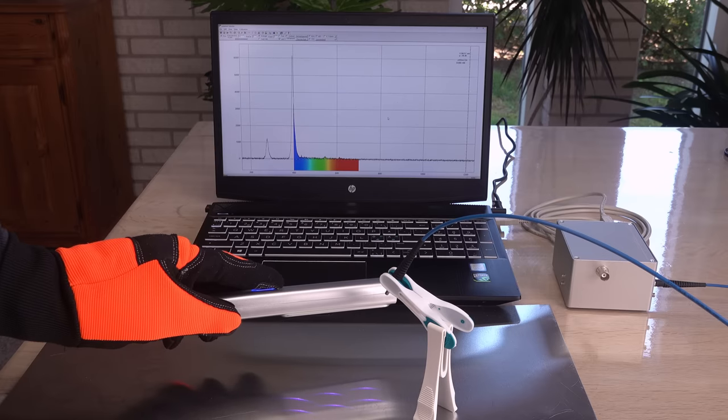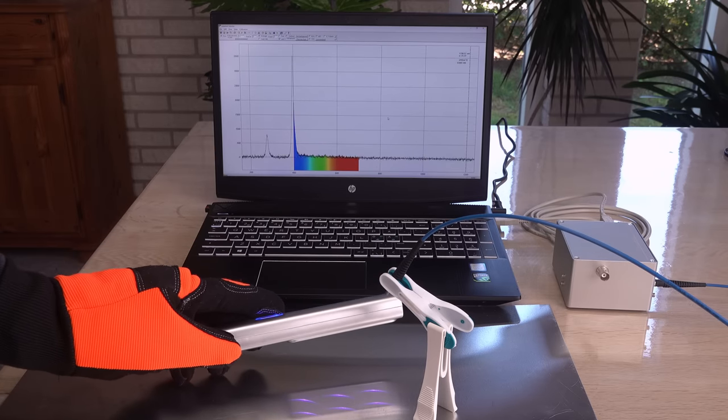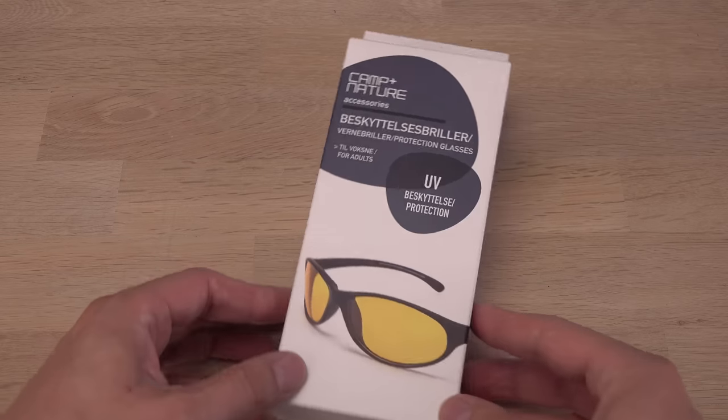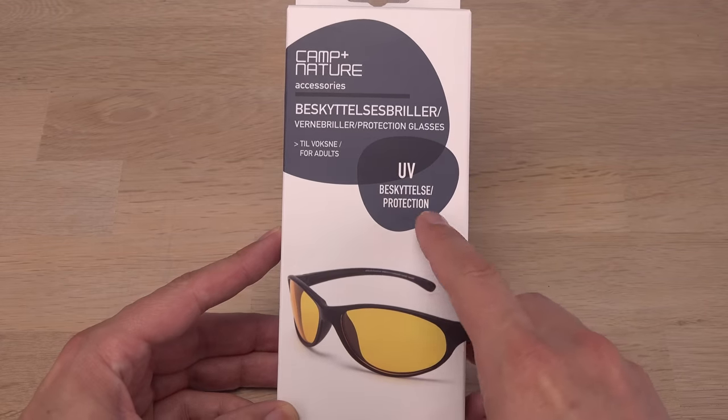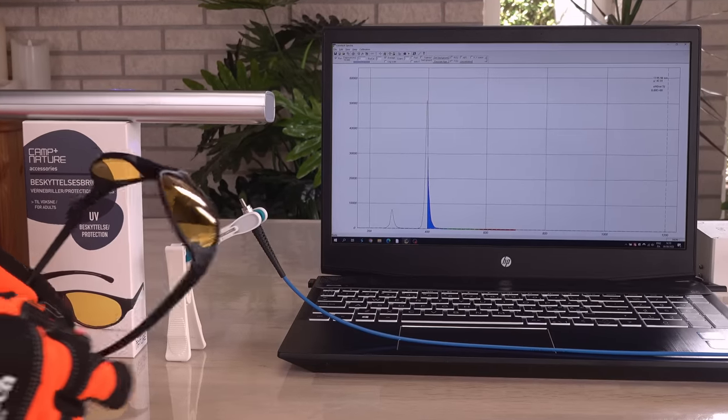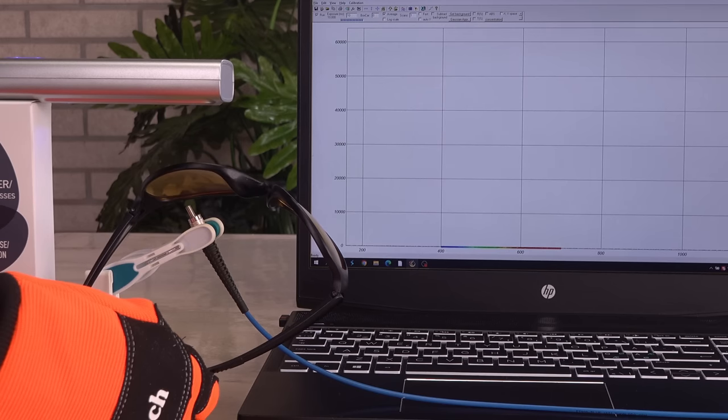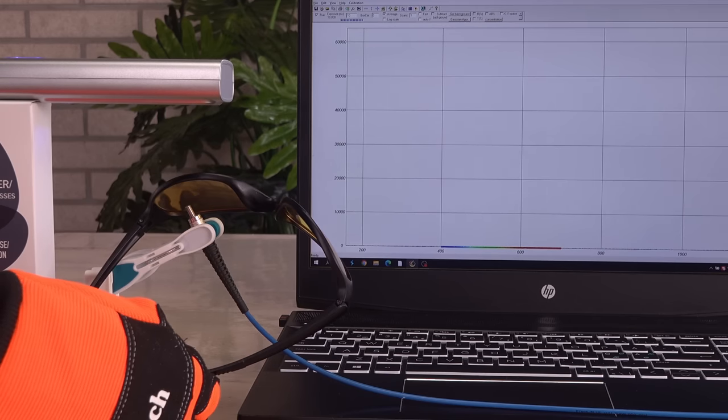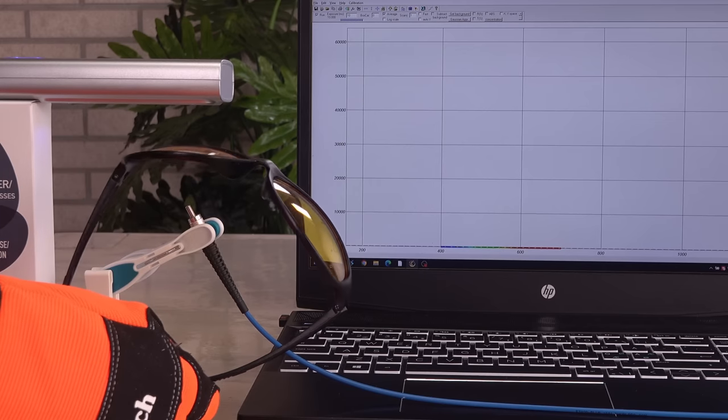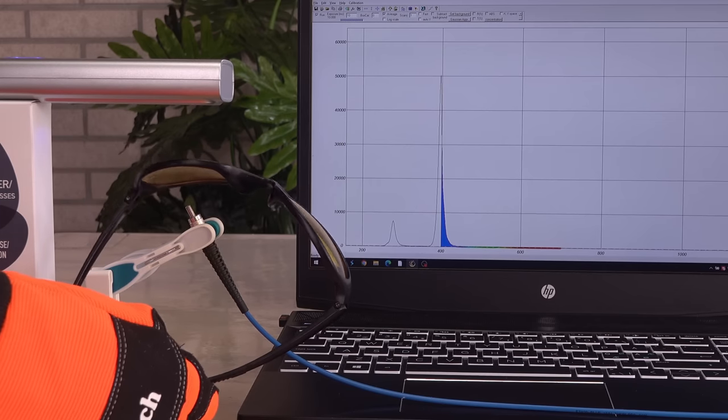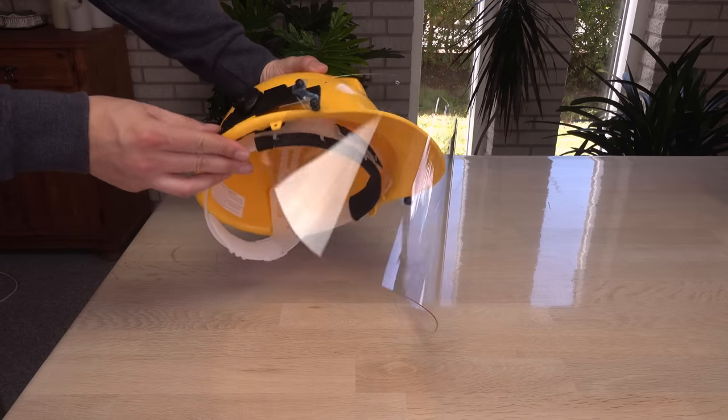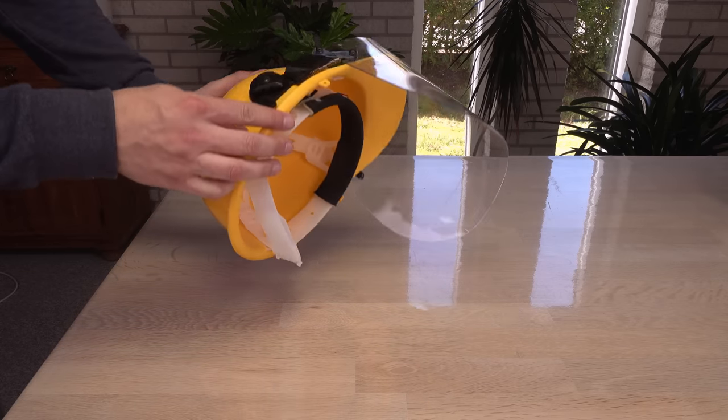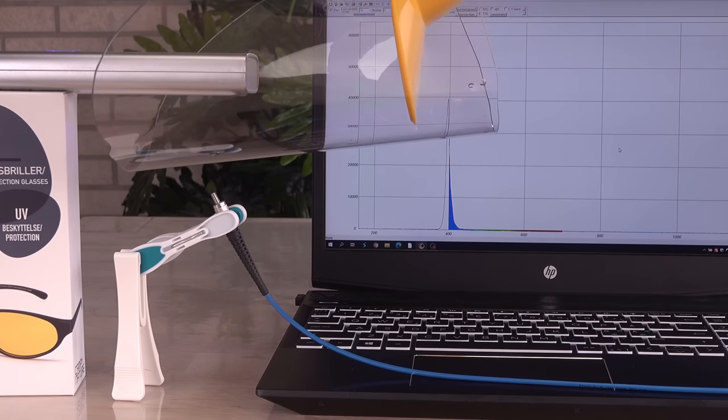Okay, despite the low reflection, I still prefer to protect my eyes against the UVC. I wonder if these glasses meant for amber searchlights will do the job. Oh yes, these will protect my eyes against all UV. Nice to know. UVC is actually absorbed by a lot of transparent materials. This polycarbonate visor removes it too, but not the UVA.